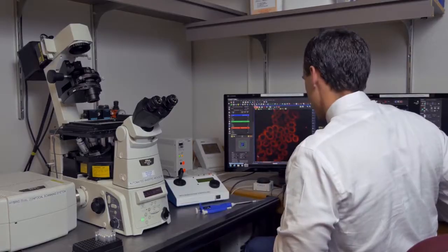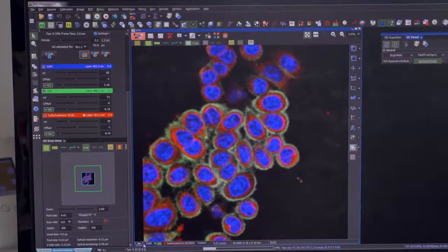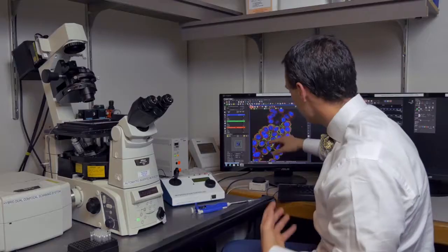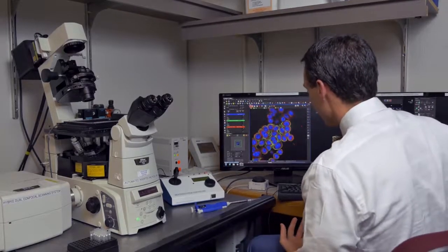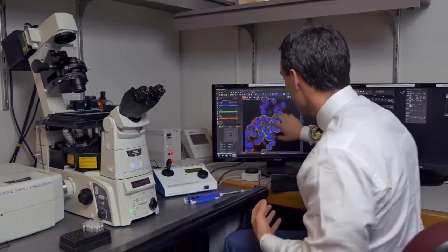And so we go back now to all three images. We see a beautiful outline of the green, the cell membrane, and then the red, the essential oil, in the cytoplasm. And we can see with this particular essential oil, it seems to be largely free from the nucleus, but is being retained predominantly in the cytoplasm. And we see each essential oil has unique characteristics in how it localizes inside the cell.